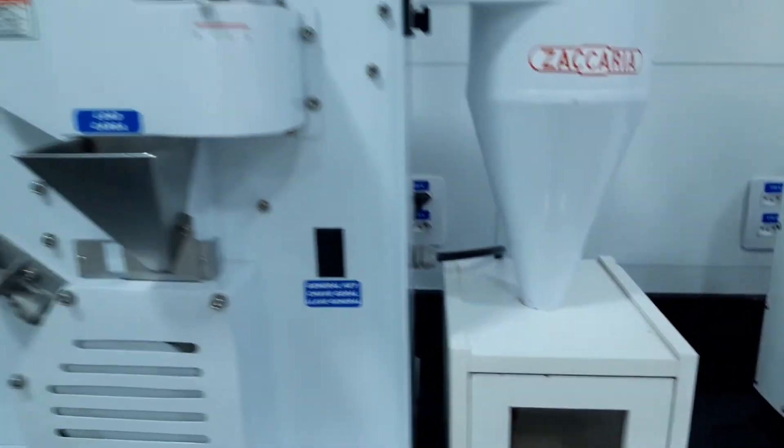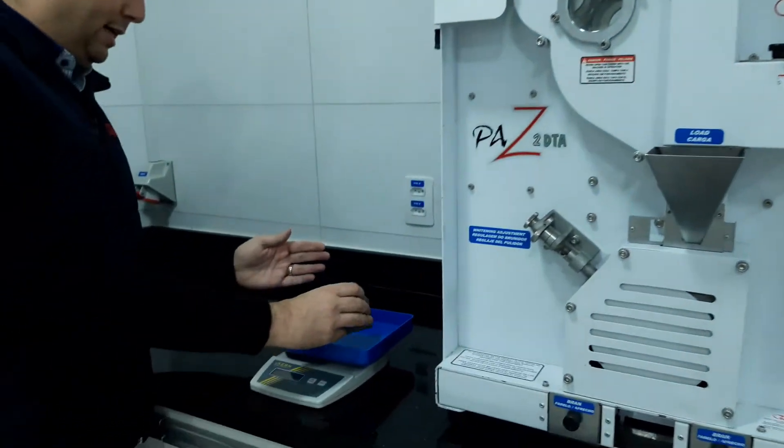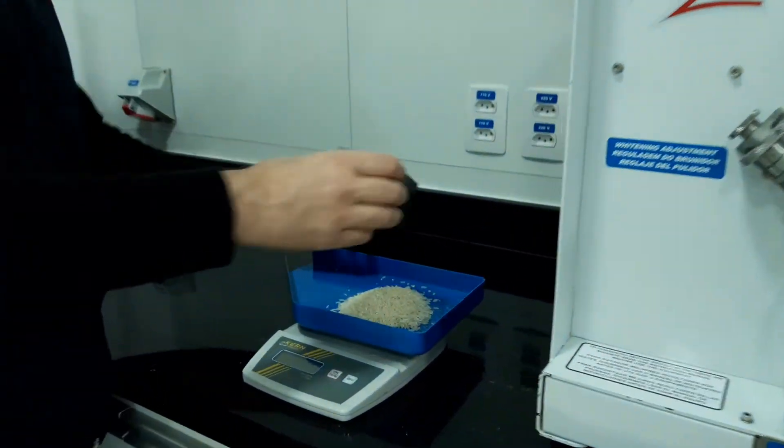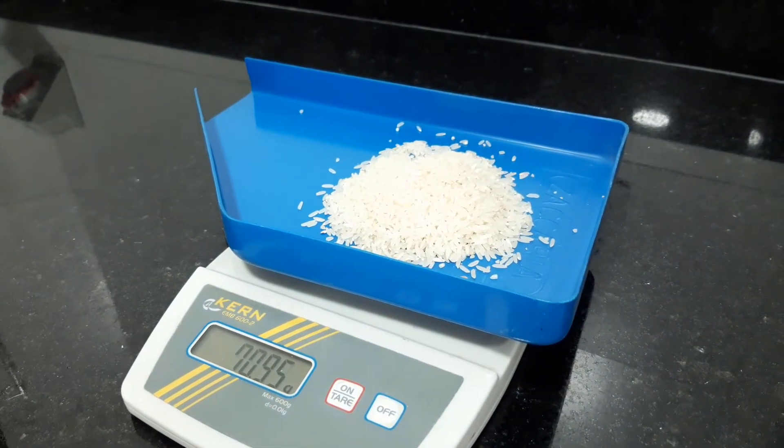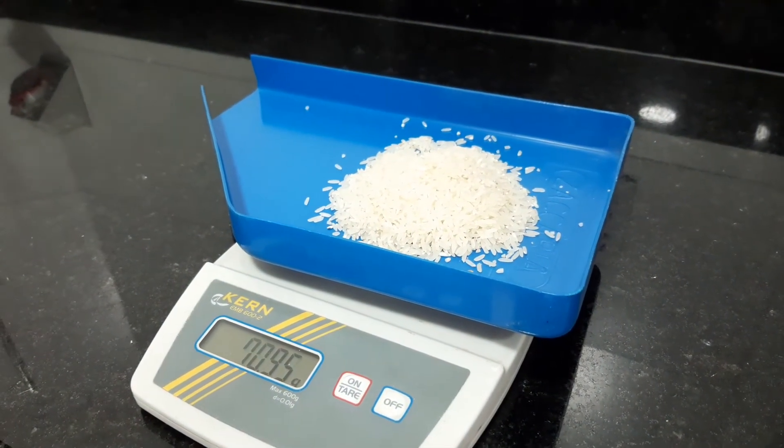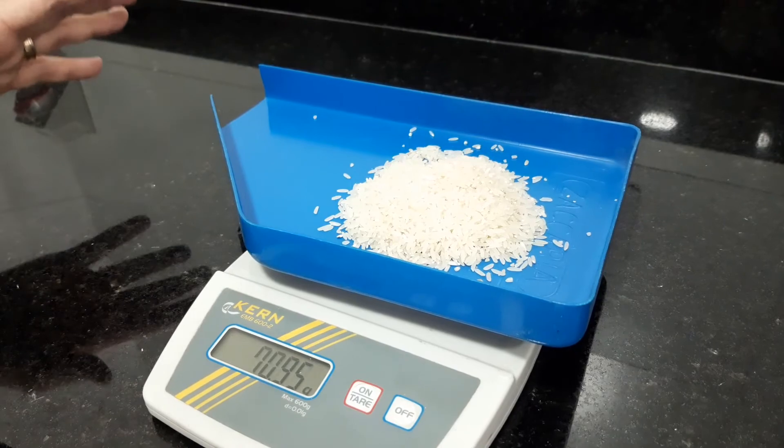Now with the white rice we will measure again and see the yield of the rice. From this rice we have 70 grams point 95 of white rice.